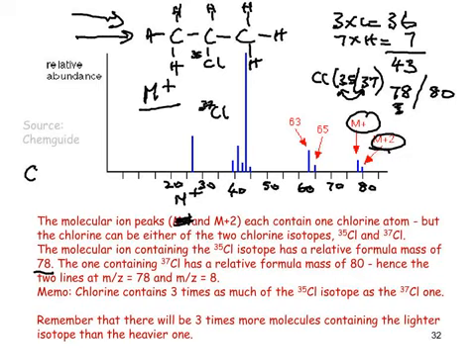If you find that you get a smaller peak to the right of that, 2 units up, this should make you suspicious of the fact that we're dealing with chlorine isotopes, explained by the fact that the less common isotope has a mass 2 units greater. You can pause if you want to read a fuller explanation down here.